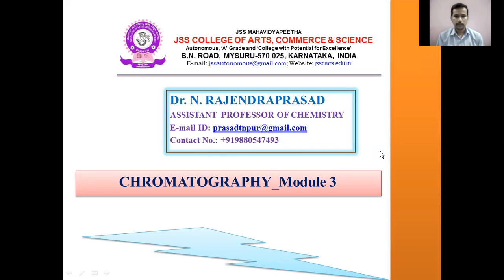In our previous modules, we have discussed the basics of chromatography, how the separations are performed by using chromatographic techniques, the role of stationary phase, mobile phase, and how the analytes interact with the stationary phase during the separation process. All these things we have discussed, and we have understood the classification of chromatographic techniques, how they are classified based on the nature of the mobile phase.